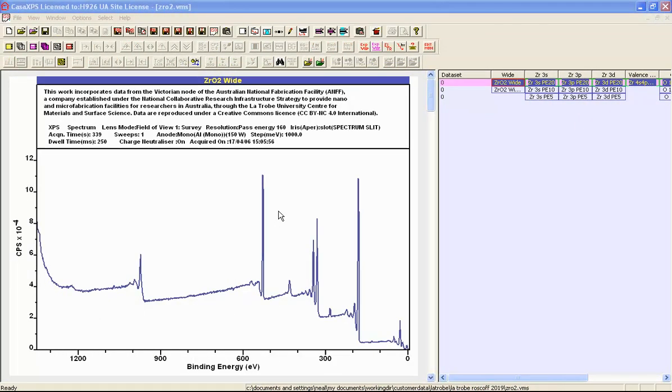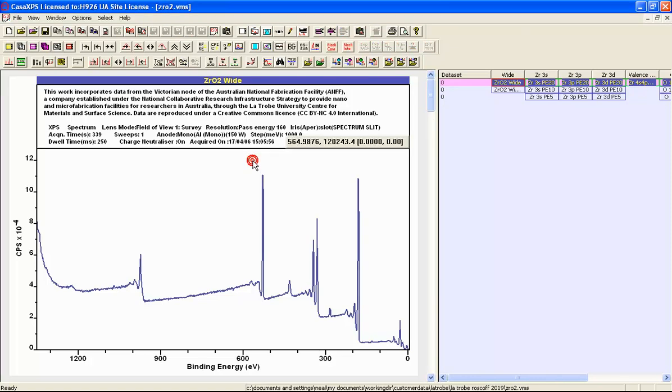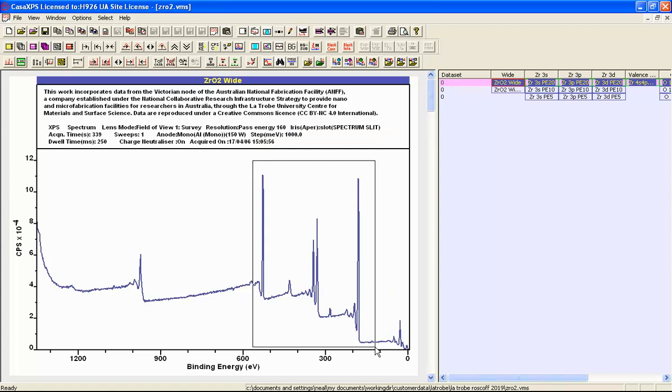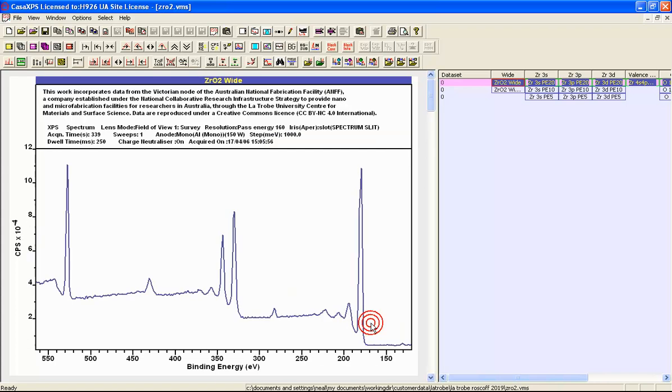In this video we're going to look at how to quantify zirconium oxide, and the reason this is interesting is because there are a number of photo emission lines that are available for zirconium to quantify against an oxygen peak.